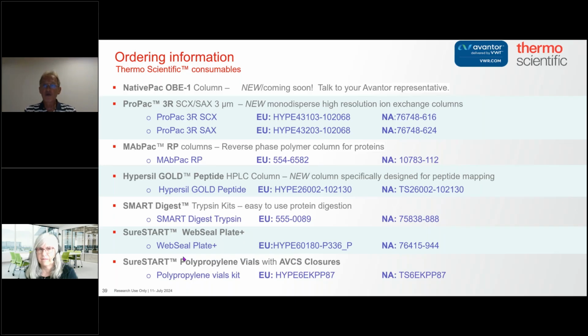If you're doing new peak detection in particular, you'll get more new peaks popping up because you've done the digest wrong than because you've actually had new peaks. So you want really good reproducibility for that digest. If the digest is reproducible, then your assay and your multi-attribute method are much more reproducible.